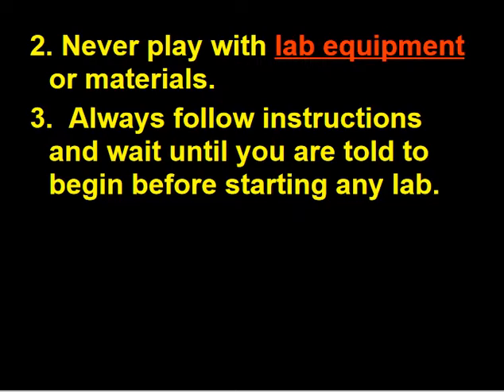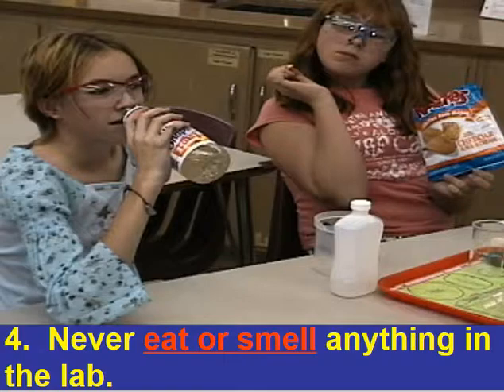Never play with lab equipment or materials. So don't just walk into the classroom and start playing with things. That's how things get broken. Always follow instructions and wait until you're told to begin before starting the lab.